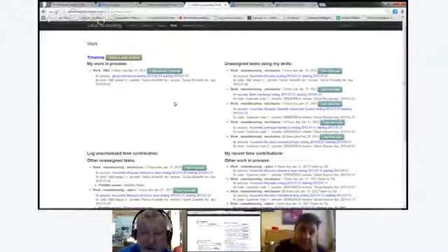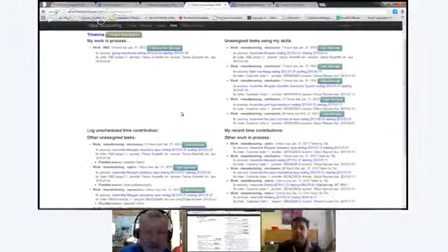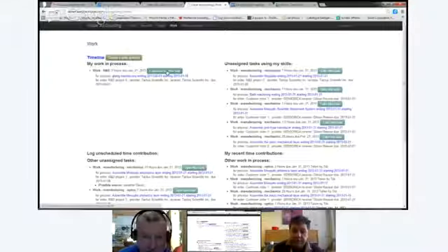It appeared in Francois' my work in progress, and now it automatically created a lab note. When you click that button, it will create the lab note, which is your tool now to document your work in progress. It takes notes about the process and everything else.